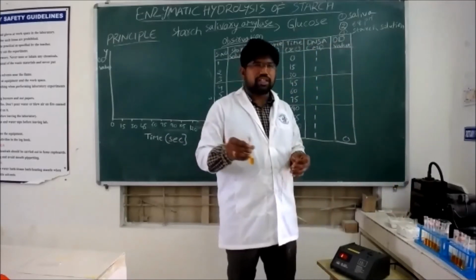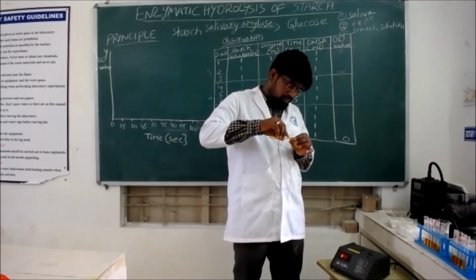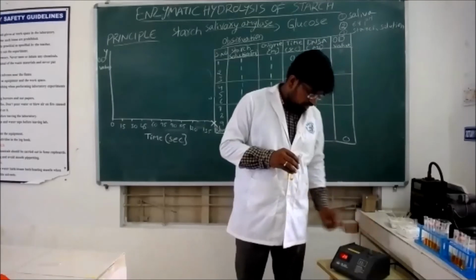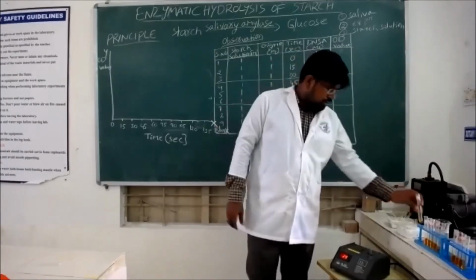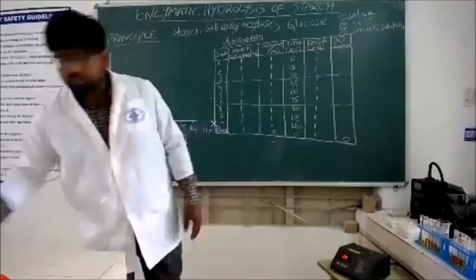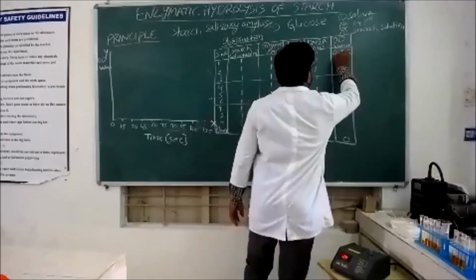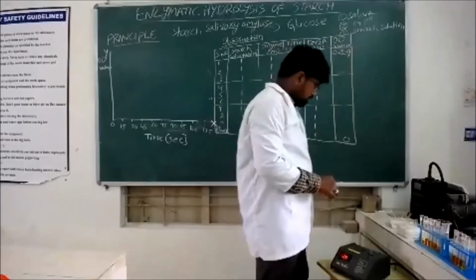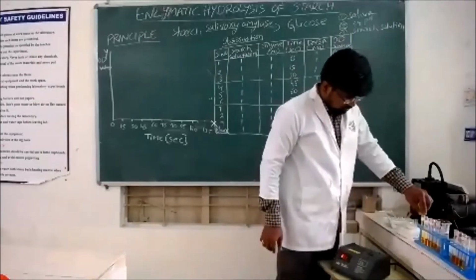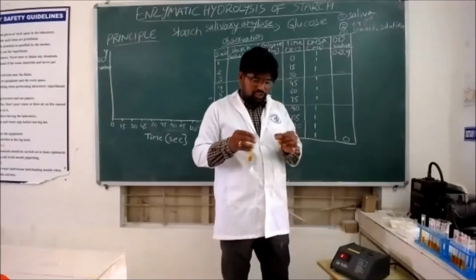First I am taking the 0 test tube, meaning 0 seconds. The absorbance is 0.29. Next, let's take the second test tube.